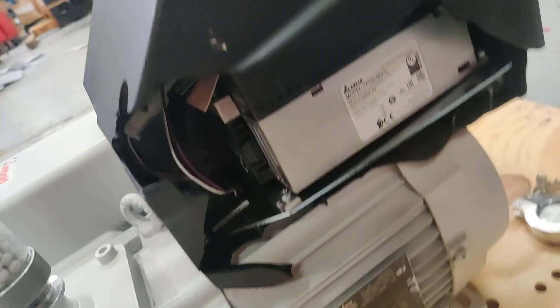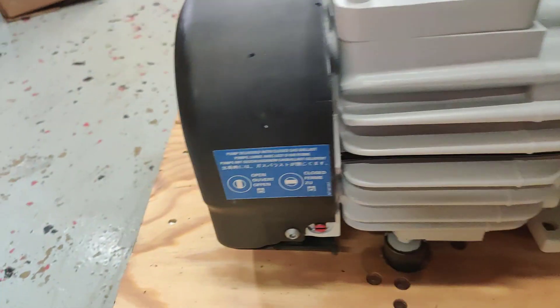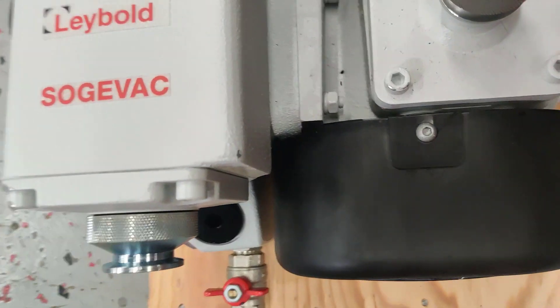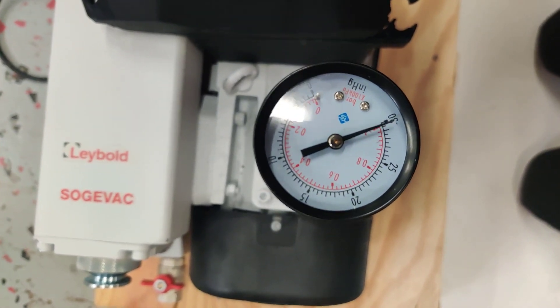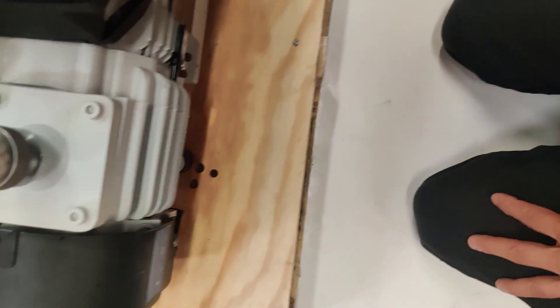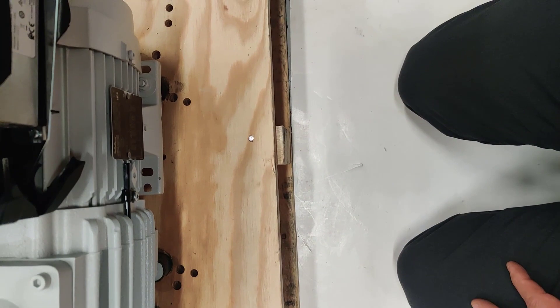Other than that, the drive, the motor, the pump — it is working perfectly. And it reaches 30 inches of mercury vacuum.